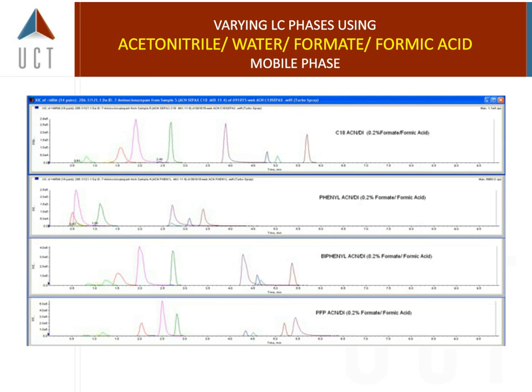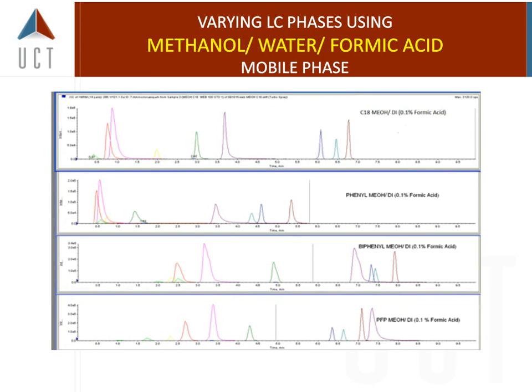Now you get down to the biphenyl and the PFP, which are both phenyl compounds in the phases, and they have similar retentions. Remember, a lot of the molecules that we're dealing with in forensics and toxicology, as well as even environmental, if they have rings, then they're going to have that pi-pi interaction. And if they have a pi-pi interaction of the electrons to the biphenyl or the phenyl phases, you're going to get more retention.